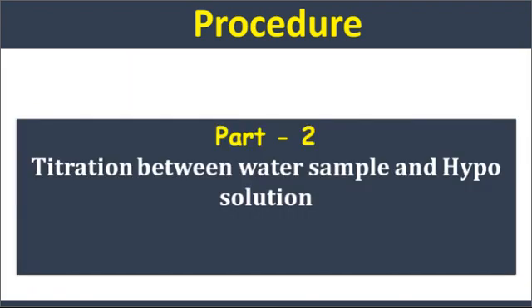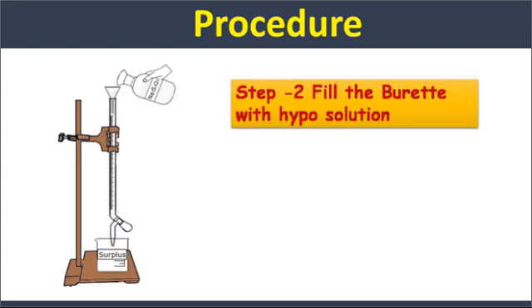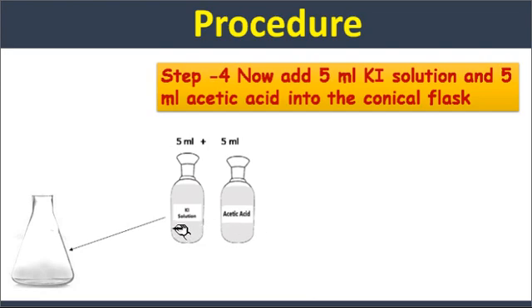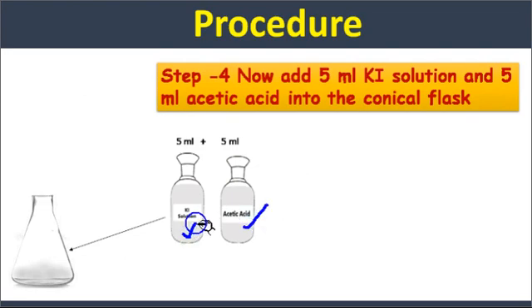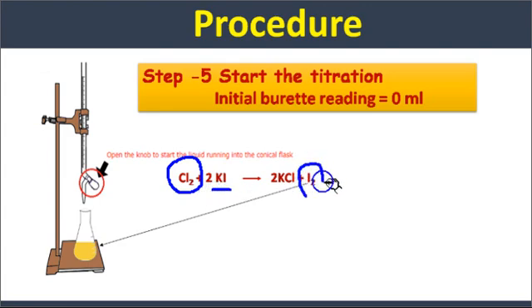Now part two: titration between the water sample and hypo solution. Take a burette filled with hypo solution. Take 10 ml of the water sample in a conical flask using a pipette. Add 5 ml of potassium iodide and 5 ml of acetic acid. Acetic acid provides the acidic medium while potassium iodide is the source of iodine. The chlorine in the water sample reacts with potassium iodide in acidic medium and liberates an equivalent amount of iodine, turning the solution brown.